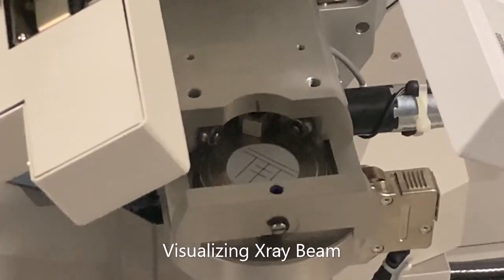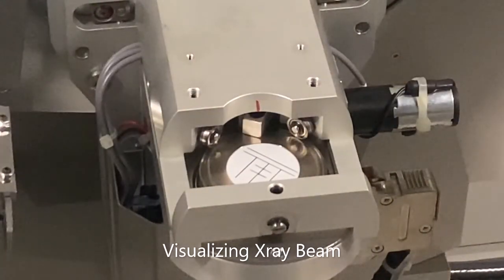In the example we're showing here, the slit is fixed at a particular separation, but when the source is at a low angle, it produces a projected beam that has a very wide coverage of the sample. And as the source moves clockwise upward as theta increases, the orientation of the slits becomes less inclined and the beam effectively becomes narrower.